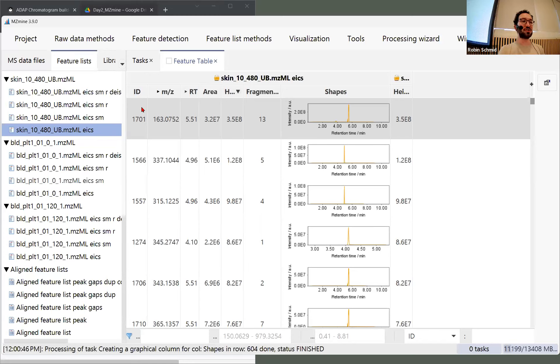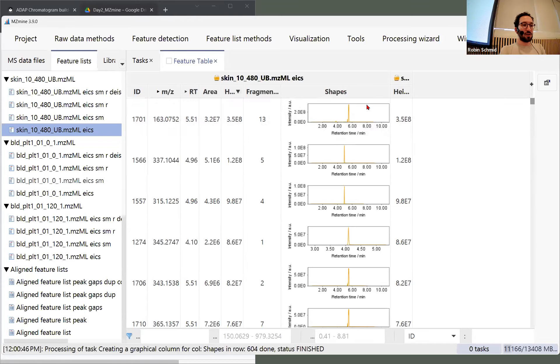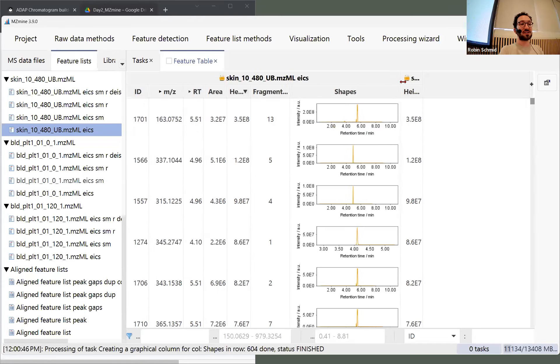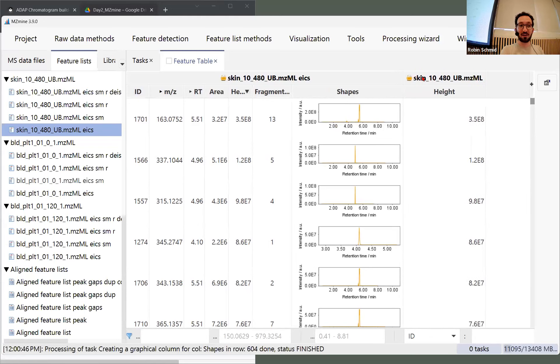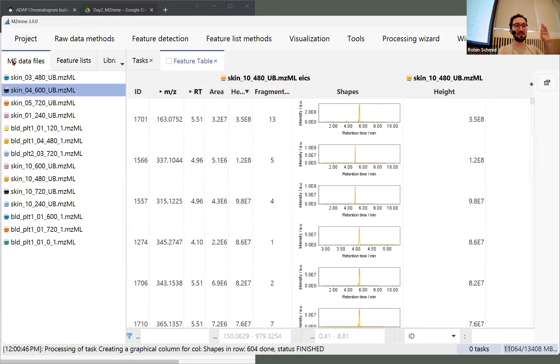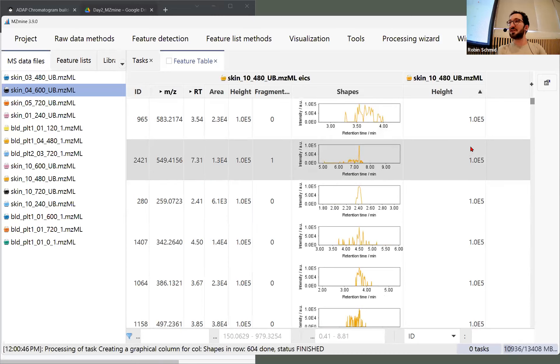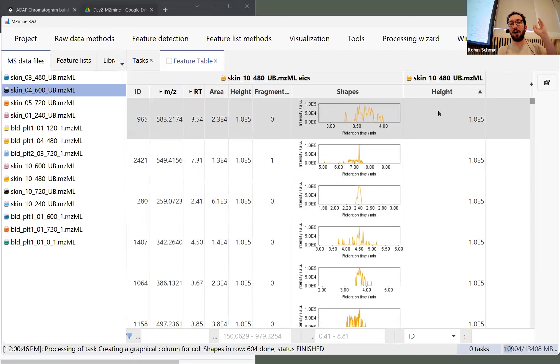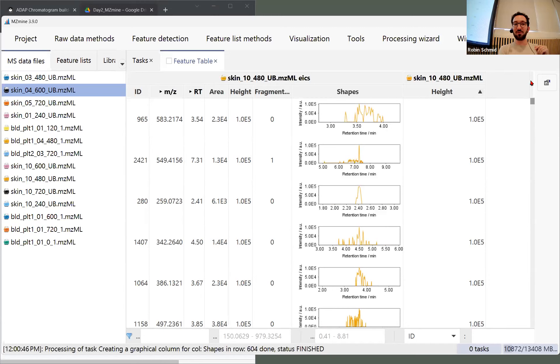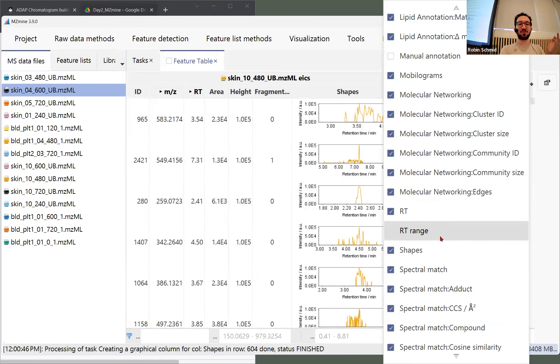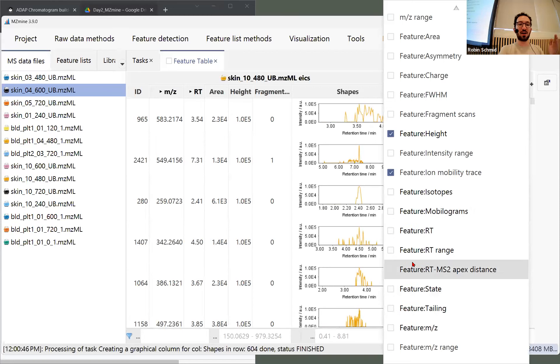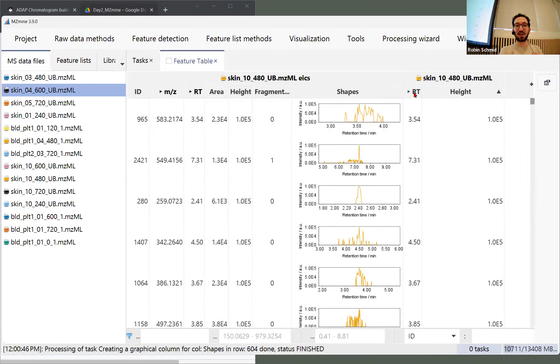From SIRIUS, from matchms and so on, we keep the ID basically and can merge all the results. Here we can see the sample — the color actually corresponds to the MS data file, so it's sometimes nice to align directly with the colors and plots. For now we only have the height of this individual sample. If I click the plus and scroll down, we see all those feature retention time, feature m/z parameters, and so on.